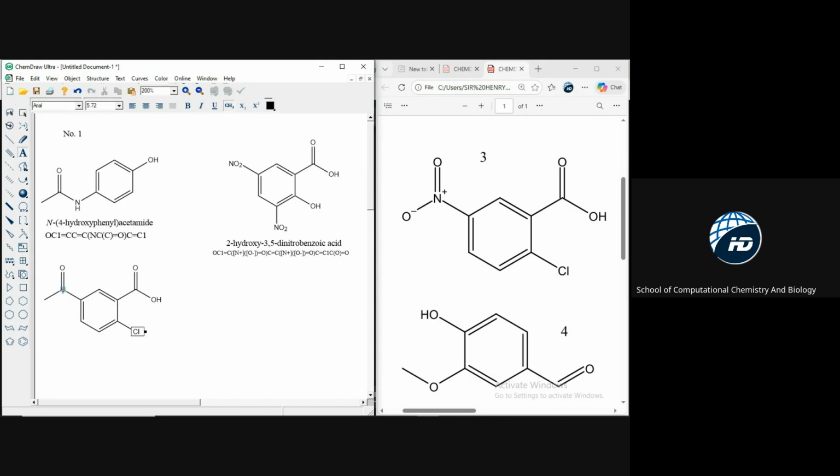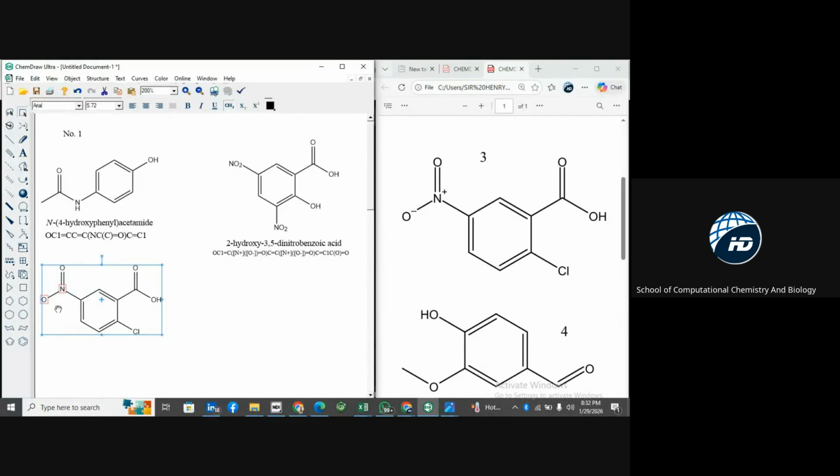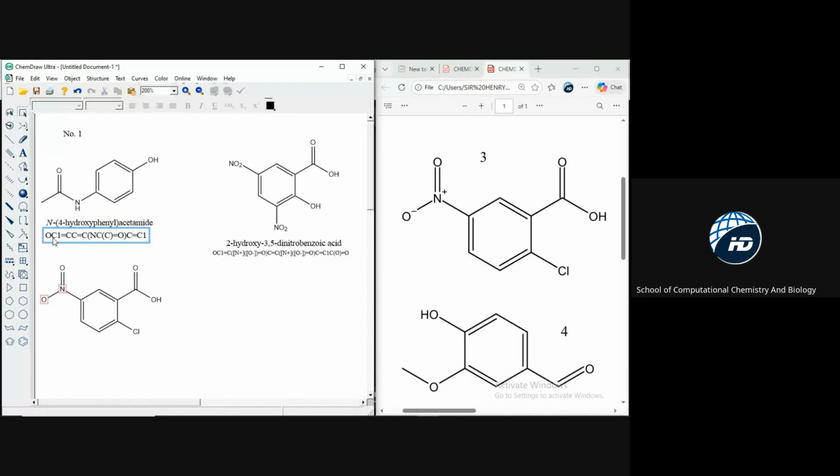Then at this point, there is N. And there is O. So this N now, what I just need to do is, because the N is showing me that it is not correct, let me see by adding my charge now. So let me add my positive charge. So you see that it has balanced.